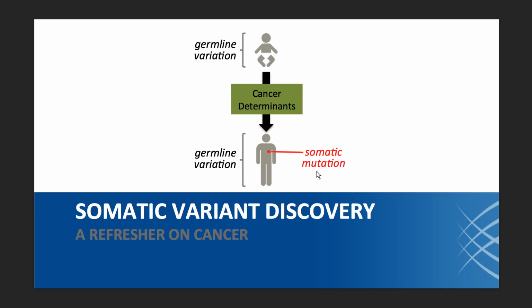So the aim of the background is to impress upon you why somatic variant discovery needs different tools and different workflows than the germline context. With somatic variant discovery, we want to detect changes against germline variation.